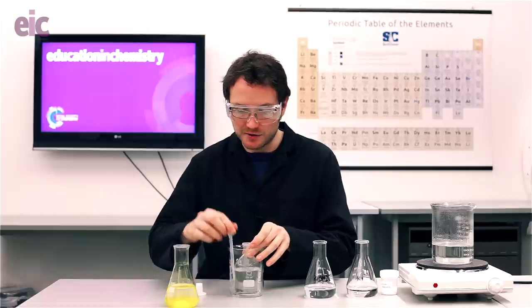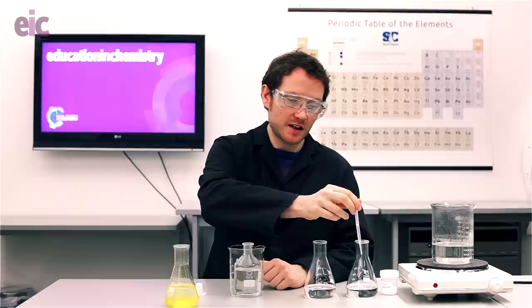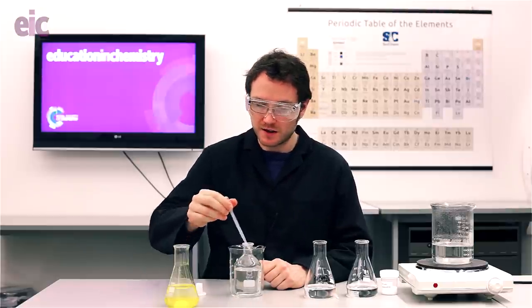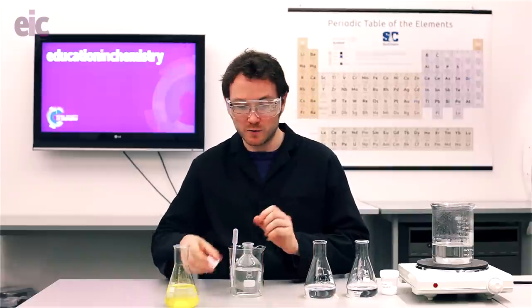I've used deionized water and I'm just going to add a couple of drops of 1 mol/L hydrochloric acid to each, and that's just going to avoid us accidentally precipitating out any lead carbonate if any carbonates have remained in your purified water, or perhaps your distilled water has sat on the desk for a while and a little bit of carbon dioxide has redissolved back in. What we want to avoid is producing a cloudy white precipitate of lead carbonate that's really going to spoil the show.